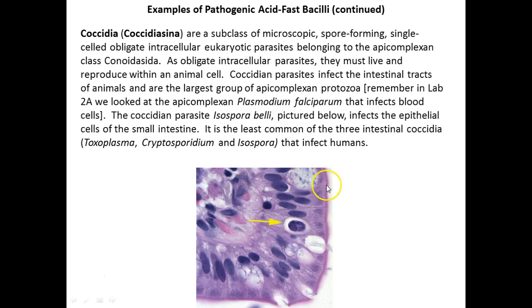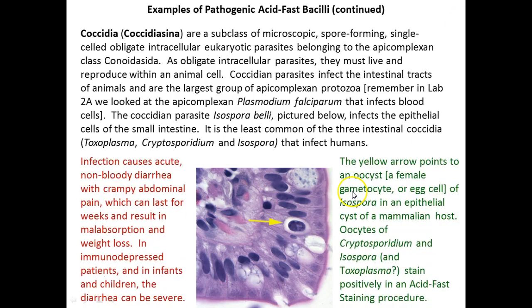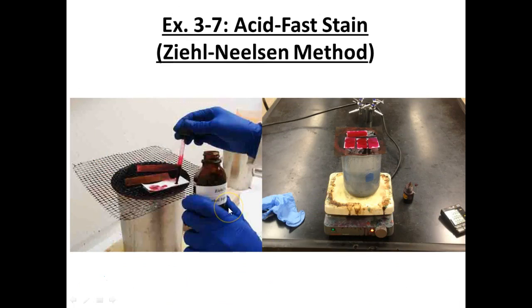There's all kinds of nasty stuff in there that can make you sick. And you definitely don't want to get sick when you're pregnant. So you'll see that we have our staining apparatus. They just have a metal beaker in the book. That's the only difference. And we have our screen.